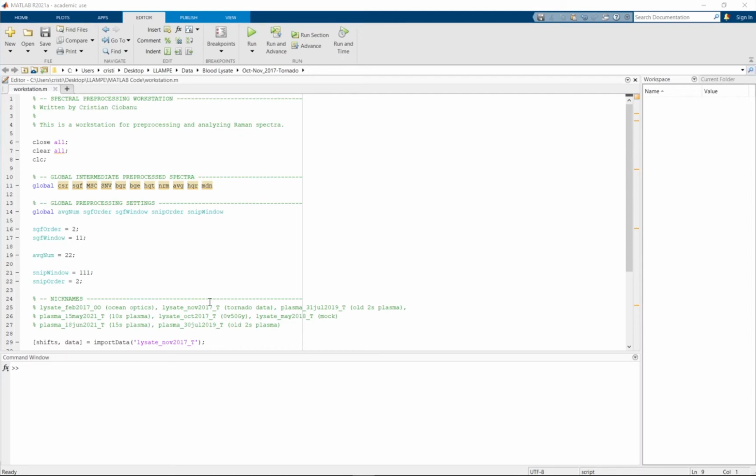In this video, I'm going to be showing you how to use PCA within PLS Toolbox. Now, before watching this video, I would highly recommend watching some tutorials on PCA on YouTube, just in case you're not familiar with the concept and some of the theory behind it.